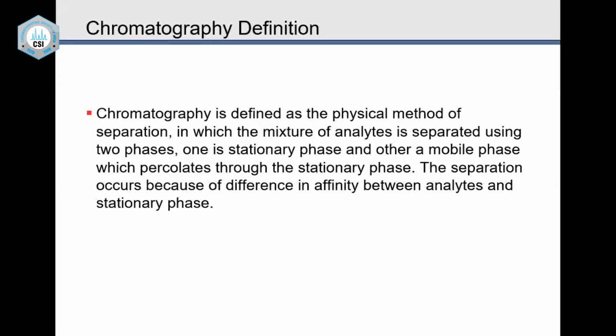And here the affinity is the adsorption. So what is important to have a separation? Of course, this kind of affinity of the substance with the stationary phase. Now, affinity is something which needs to be understood.